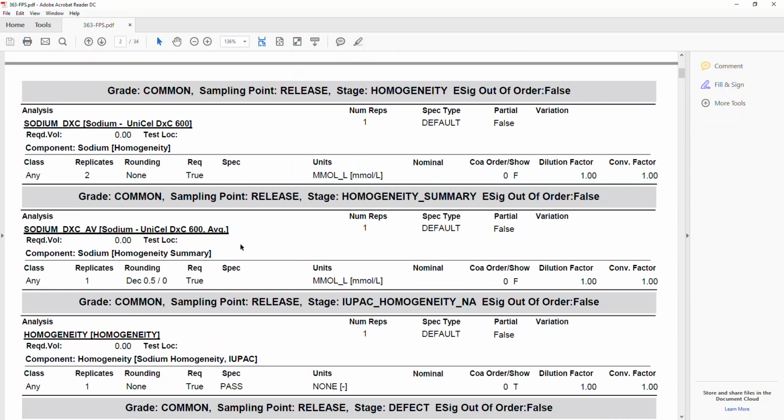And then we have what we're calling our phantom test here, which is our summary result. We go between summaries and averages in some cases based on the type of test that we're talking about and how it's being managed in SAP.